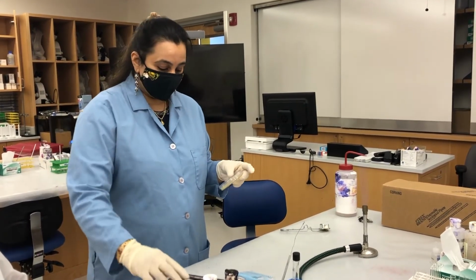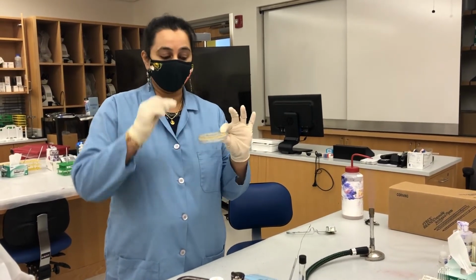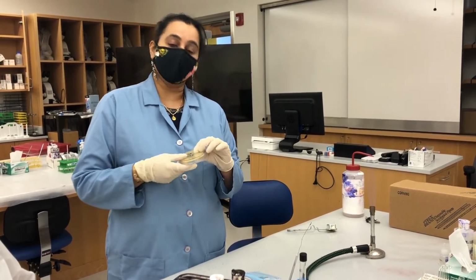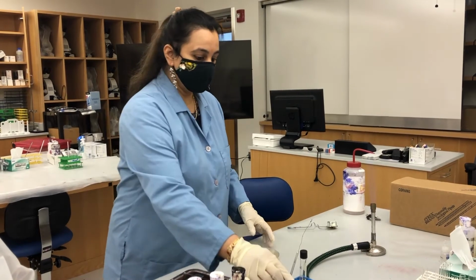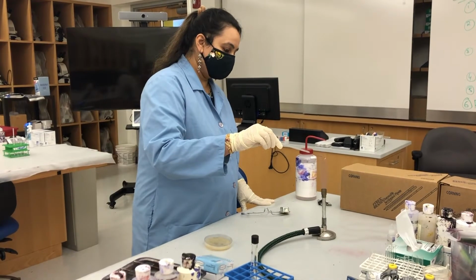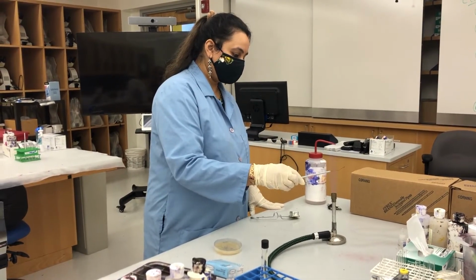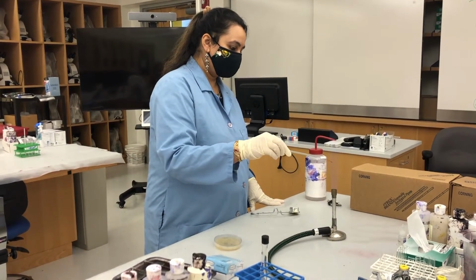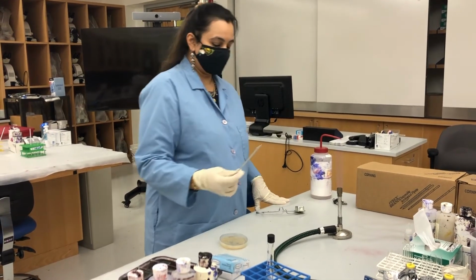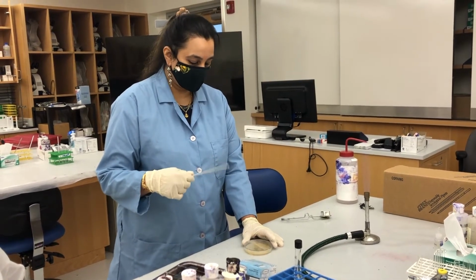Okay, but the most important thing, be very careful when you're picking the cells. You don't want too many cells on your slide, but at the same time you don't want too little. Okay, so as always, you have the inoculating loop, flame sterilize it. Wait for it to cool down.